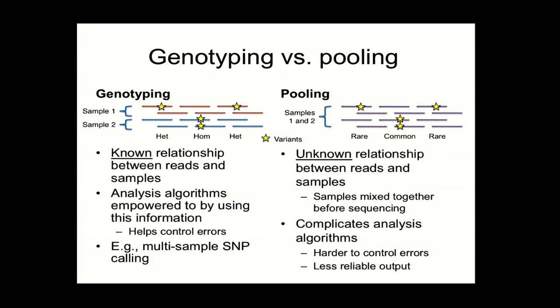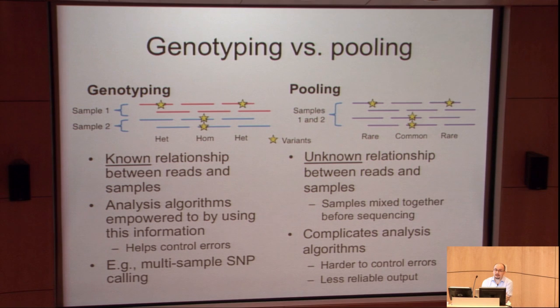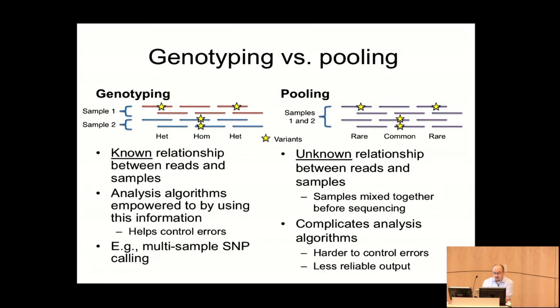Oh, go ahead. To what extent can those strategies handle variation in the genome without inaccurately pulling down? It's surprisingly robust. That is sort of my take on it. As far as I can tell, there's very little differential capture based on, for instance, having a heterozygous SNP. I mean, early captures, or if you do a design that has very short baits, this will hurt you. But the baits are 120 bases long, so they're pretty robust to single base variation. As you start to get larger and larger variation, it becomes more sensitive. But it's still pretty robust.